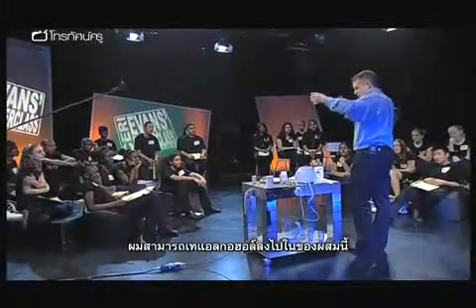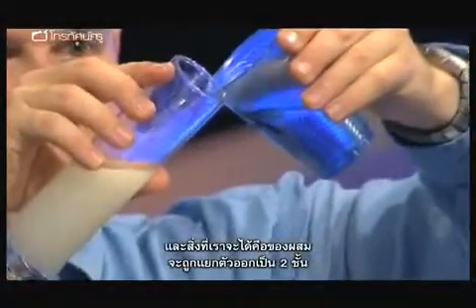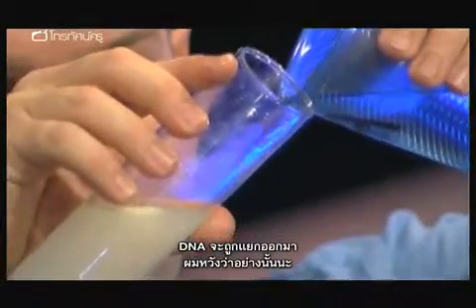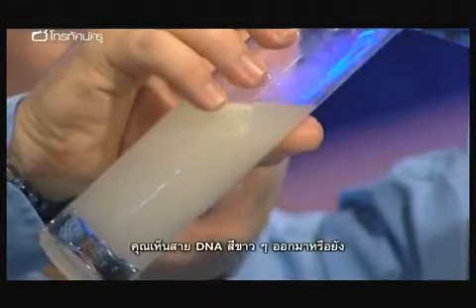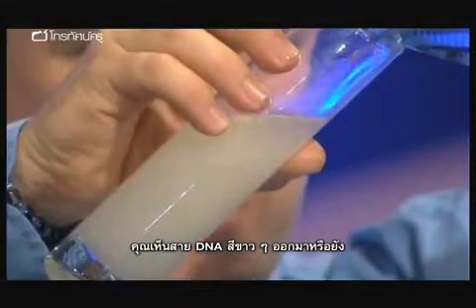Let's have a go at this. Sometimes this works, sometimes it doesn't. What we'll see are two separate layers. In the second layer, hopefully, the DNA is going to separate out, and you will see it either as some fluffy white pillows, or hopefully some strands of DNA.